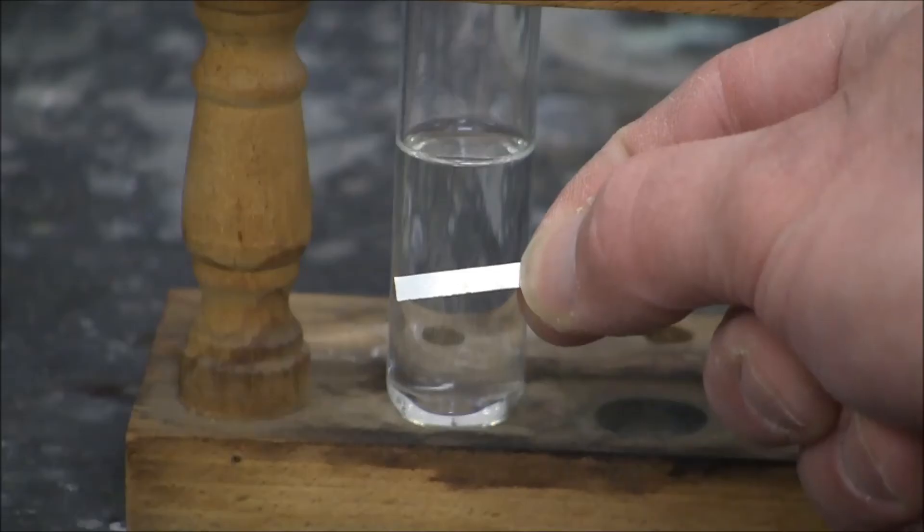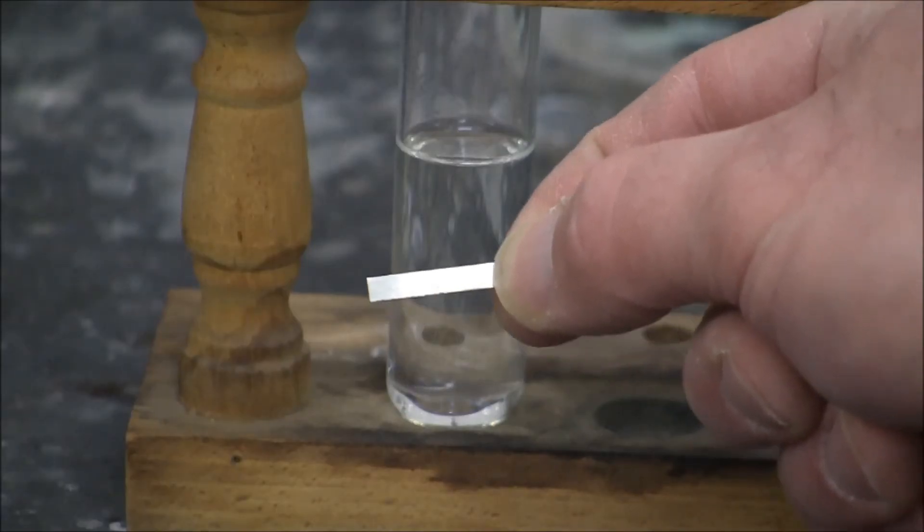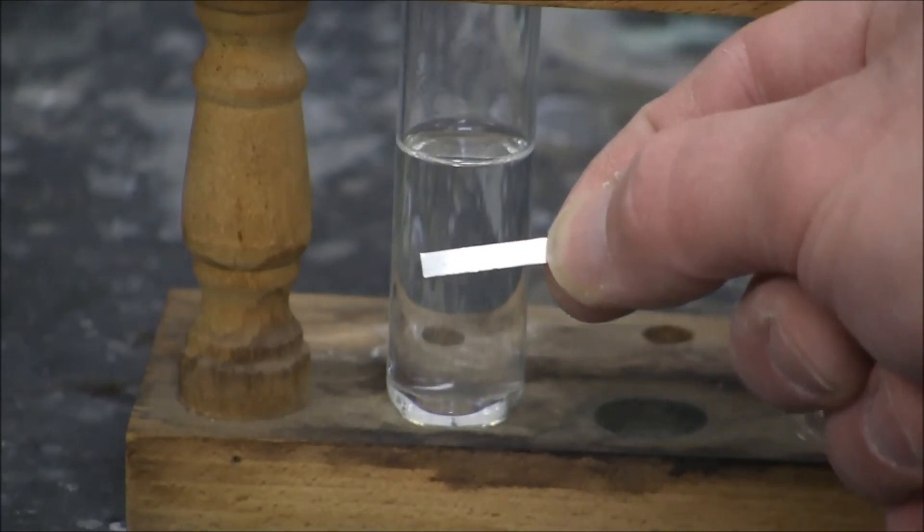A nice strip of shiny magnesium — this is about 50mg of magnesium.